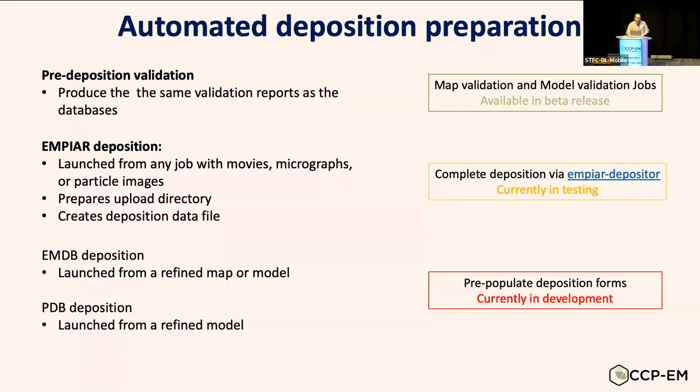Okay, so with that, I encourage everyone to download the Pipeliner, use it, build things with it, download Doppio, use it to process data. Speak to us if you're a developer and you're interested in adding your software to CCP-EM Pipeliner. We're happy to teach you how to write job tasks to include yourself.